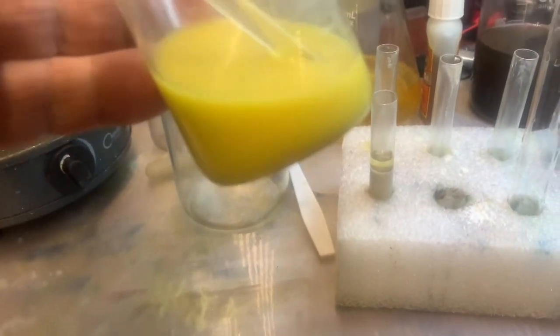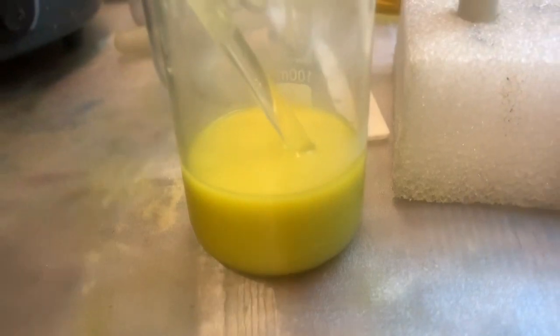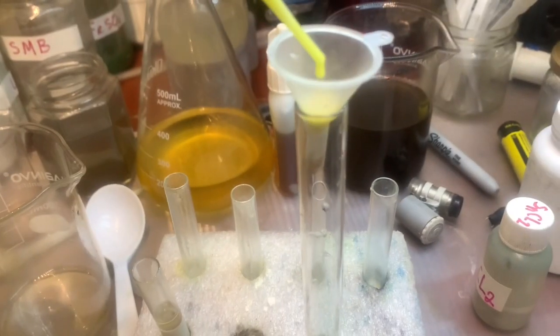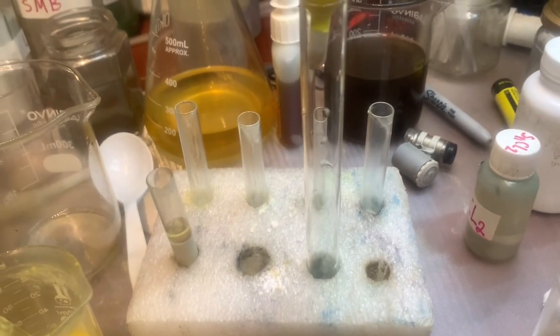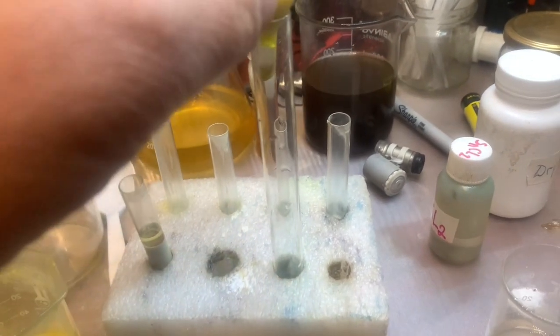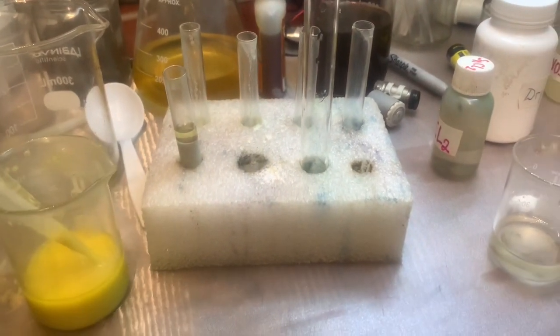I heated this solution for a while. And this is a lot of silver chloride I see, but how it became in this colloidal gold, I don't know. So let's see how everything filtrates. I put a filter, cotton filter, and let's see what filtration we get. Can we filtrate at all this juice? Okay. If we can't filtrate, then we need to wait till it settles down.